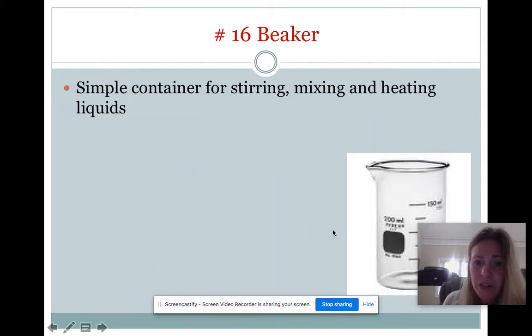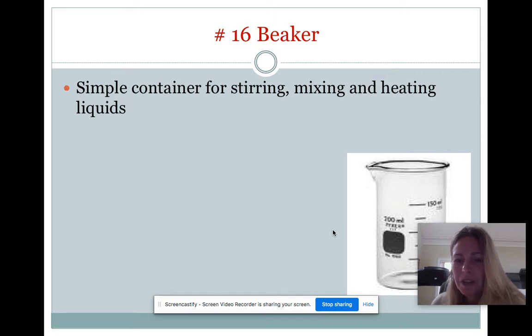All right, so this is really a common mistake. You never, ever want to measure using a beaker. So there are taboos in science. One is using inches, and then the other one is measuring. Well, there's a lot, but in lab dealings, the other taboo is measuring with beakers.